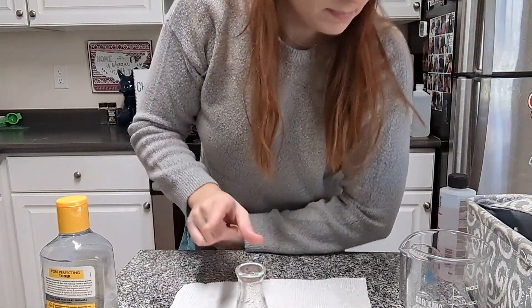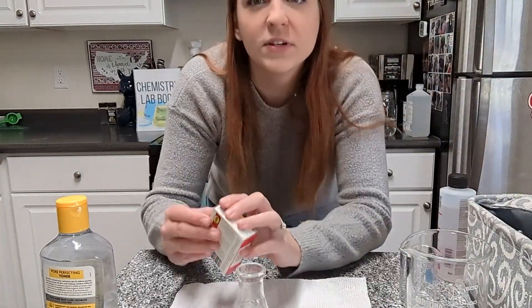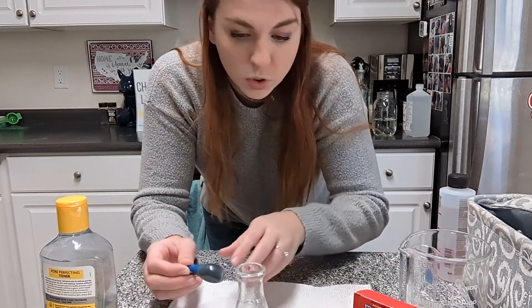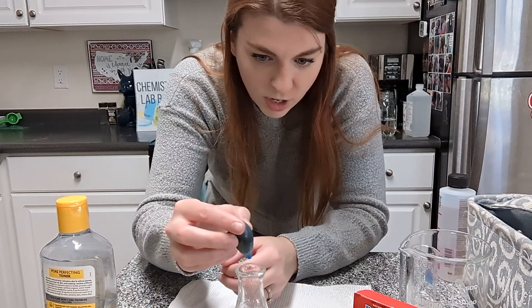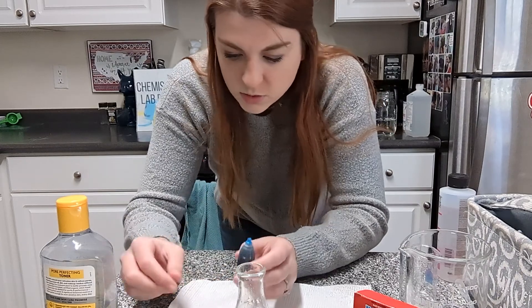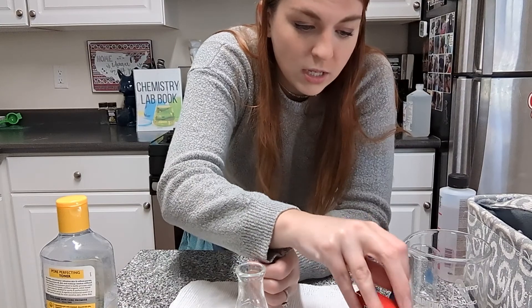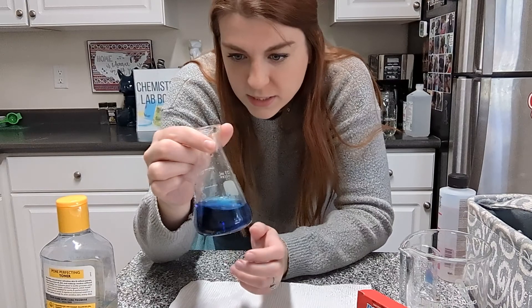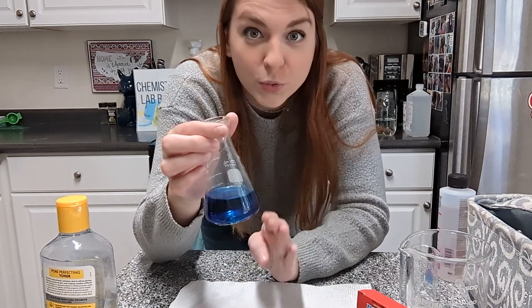Another way that I could test that is with food coloring. Many of us have used food coloring before — food coloring mixes with water, which makes it polar. So if I am struggling to figure this out, I can just add a drop of food coloring. If it mixes with only the water but leaves the witch hazel clear in its natural colorless state, that's another way to help if something is difficult to see. But this has turned the entire sample blue, meaning I now have three polar things in here: water, the food coloring, and the witch hazel.